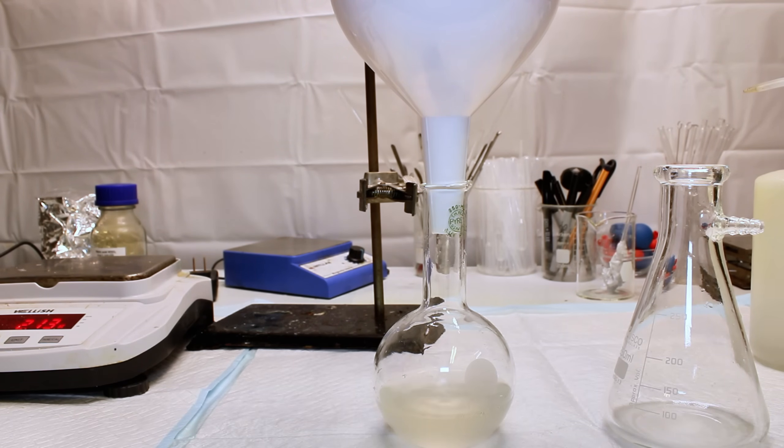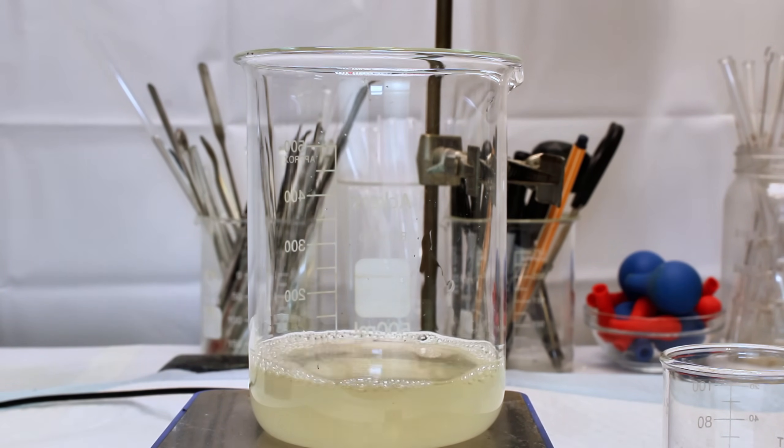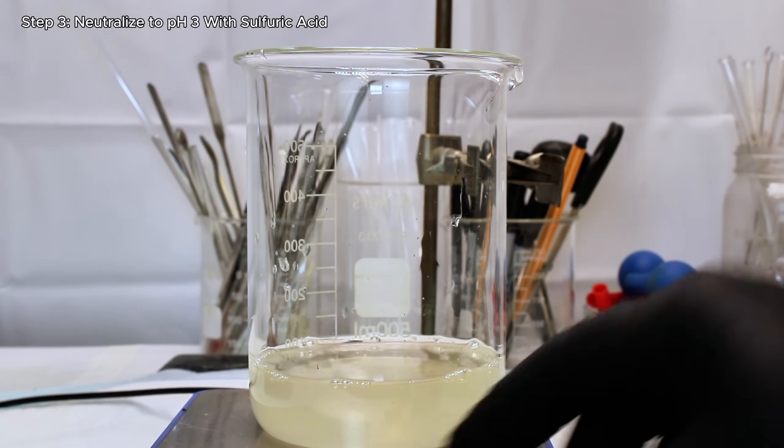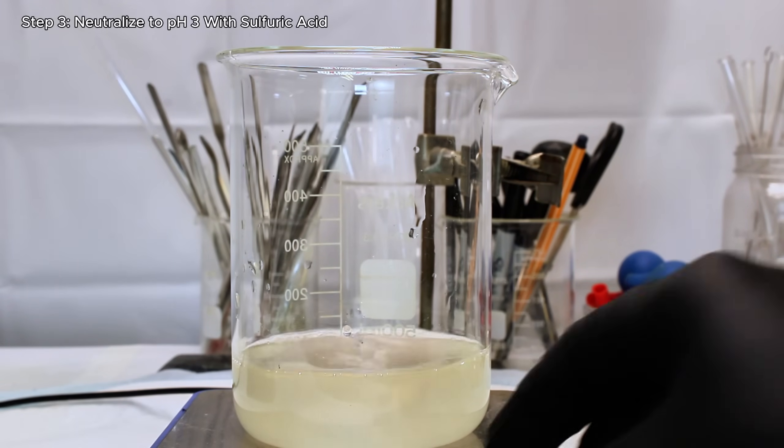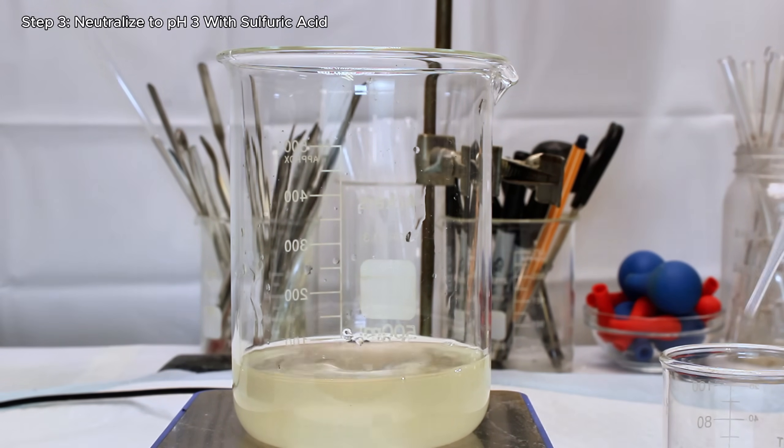And now that I had a clean and clear solution of potassium aluminate, the final reaction step was to neutralize this with sulfuric acid. This reaction is also extremely exothermic, so it's important to either make small additions like I did, or dilute your acid beforehand.